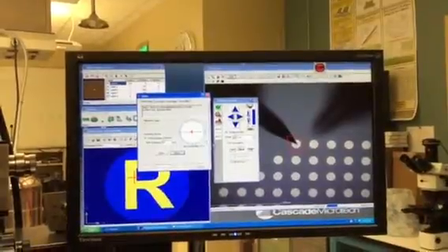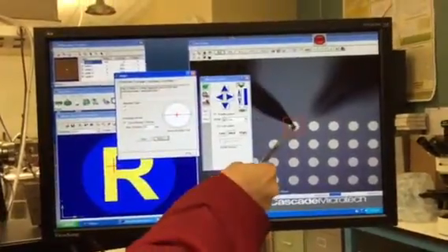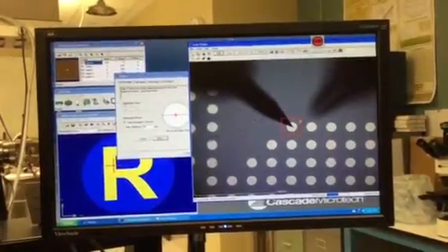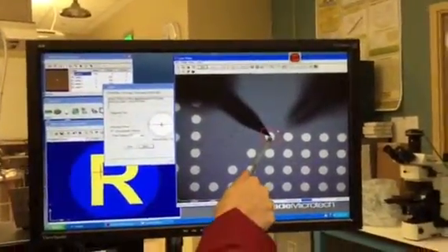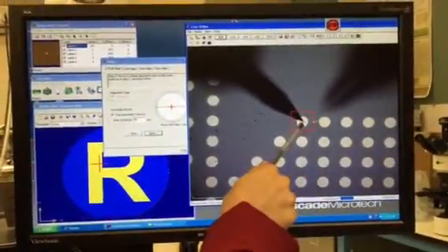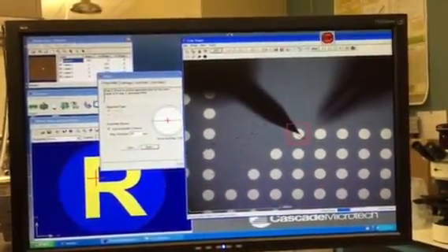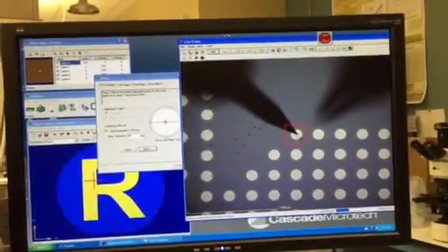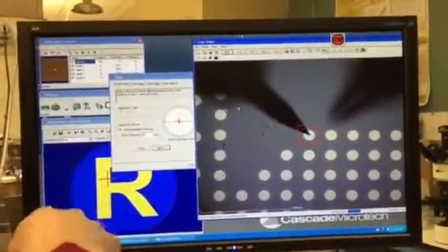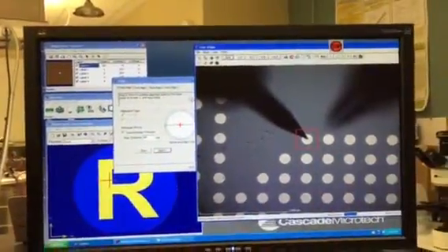That's next. So let's try that one. And we should mark it with this mark for the first point. We'll do that and put it here. Now we'll move to the middle here, this mark here. Then press next. Actually, I already did the next, so we need to be at the other one. We need to be over here.